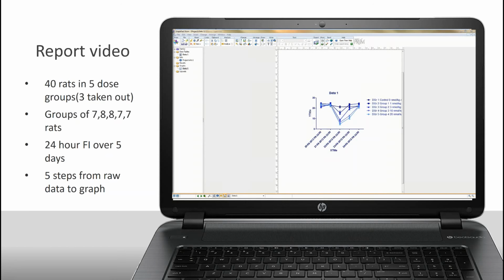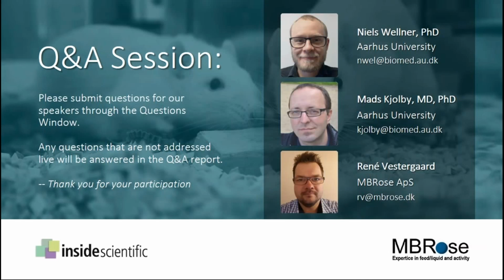Perfect. And actually, it does seem like a lot of data that is extracted very fast. Can you just remind everyone, particularly what parameters does one extract? So meal size, what else typically is organized into those columns? Sorry, I don't follow much. Right. So in your presentation, your last slide had a list of the parameters that one would extract from the data.